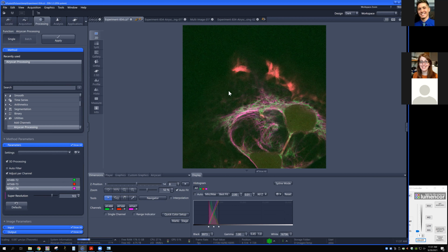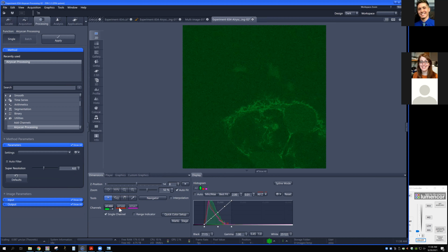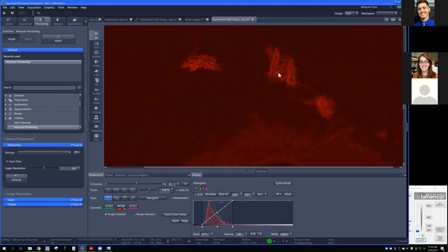And what you're going to see, I think, with every single one of these is the classic deconvolution artifact that you will literally see on anything that you over process or over bake like this. That green one's really hard to see. That looks pretty good. And this one looks pretty good. What that's always going to look like is basically this regularly spaced mottled appearance, or these little black pock marks everywhere.